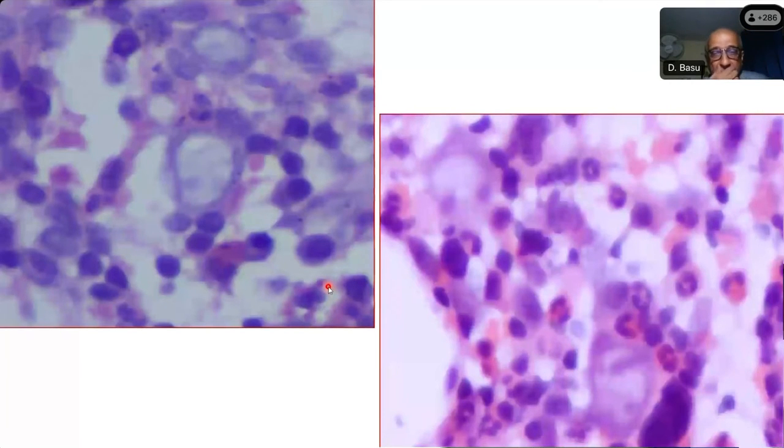So again, in this biopsy picture as well, we can see some cells having pale-looking cytoplasm and prominent nucleoli pushed towards the periphery of the nucleus. Yeah, very pale-looking nucleus, not cytoplasm. Sorry, nucleus. I mean to say nucleus. Yeah, I know you meant it.